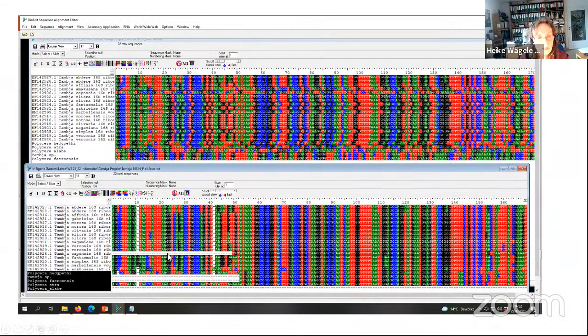So in this case, it's the capensis. Where is the capensis here? It's here. You see, it looks so different here. It's because it also starts, of course, in number 1 here, but now it is properly aligned and now it starts actually here. So when we are looking at the position, the homology of this position, the T, it's violated. It's not true. But now here it's correct. The T belongs to this. This is actually the homology hypothesis.